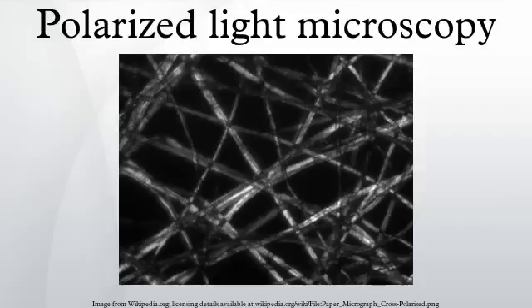Comparison of transillumination techniques used to generate contrast in a sample of tissue paper.